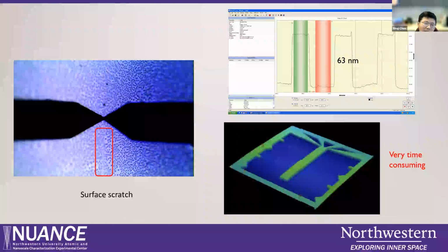Because this is a contact method, on the left image, if you look carefully, that is the real image of the stylus, and on the right, the reflection. Below the tip, if you look carefully, there is a scratch. Because it is a contact method, if your pressing force is too strong, or if your material is too soft, it can make a scratch. Of course, this scratch will damage your sample and accumulate particles on the tip, so the measurement is not accurate. You have to be very careful to check whether a scratch was made.